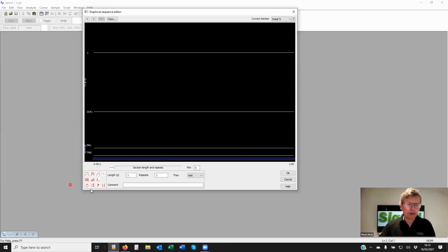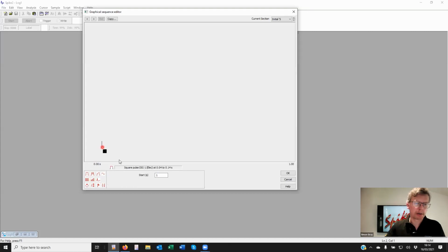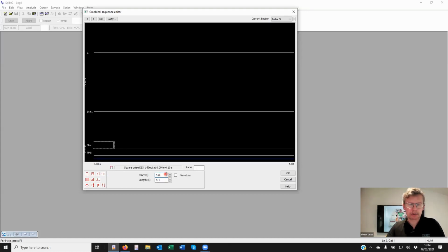For some people, using such things as talkers, this initial section is really quite important. Because this runs at start time, we can put in, say, a digital pulse at 50 milliseconds, for example, and this would go off to trigger, say, a Delsys Trigno system to say, now send us data. That means that with the talker, we can then align the incoming data from the Delsys system with the known 50 millisecond time offset in the Spike2 document. So we've got a common, a known start for the talker, after which the drift correction will take over.